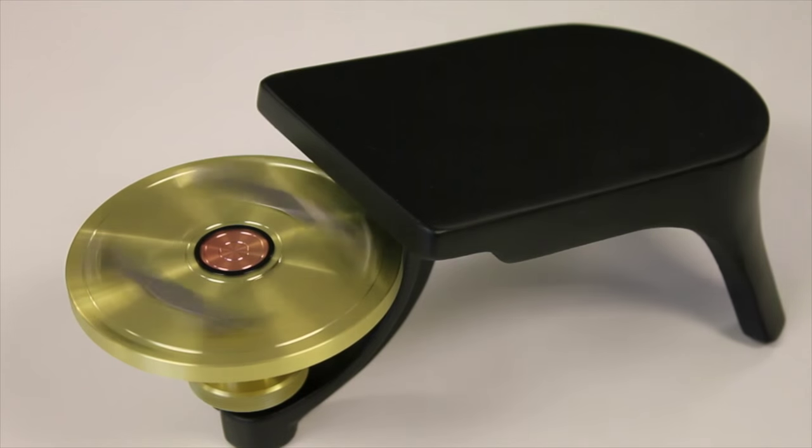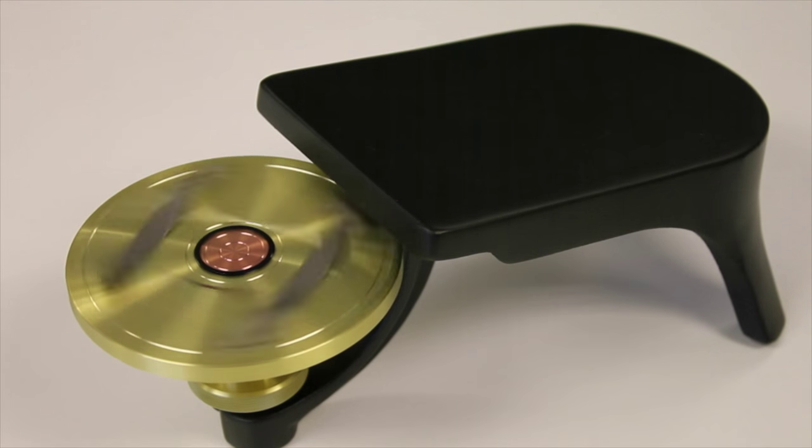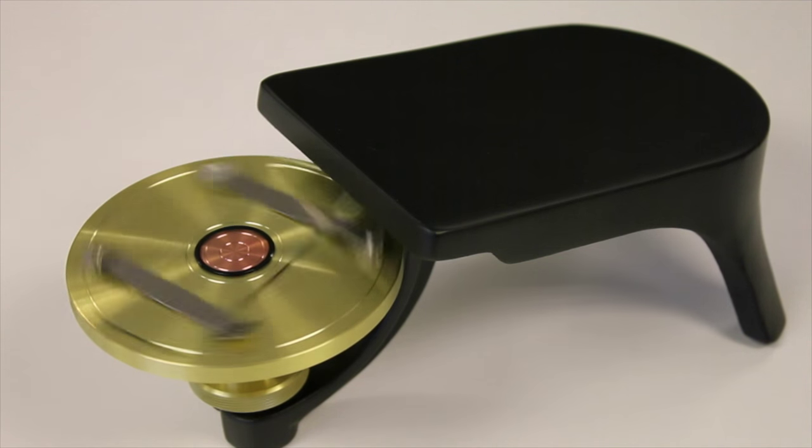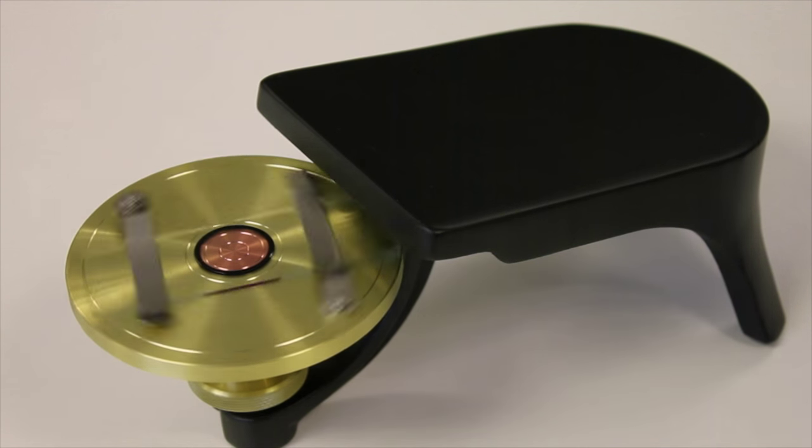The Brunow Ringing Table is manufactured by ourselves and is designed to give a fast and free spin time, which is the secret of successful slide ringing.